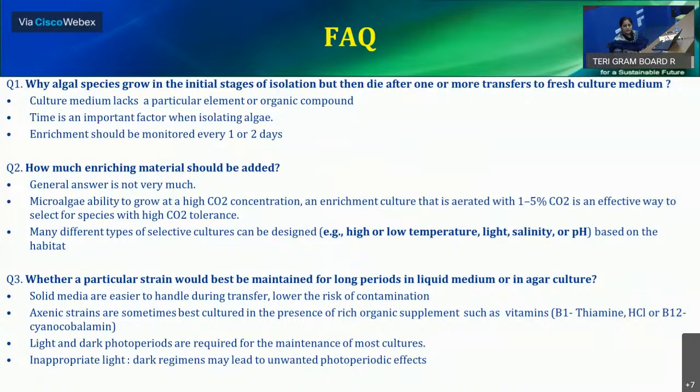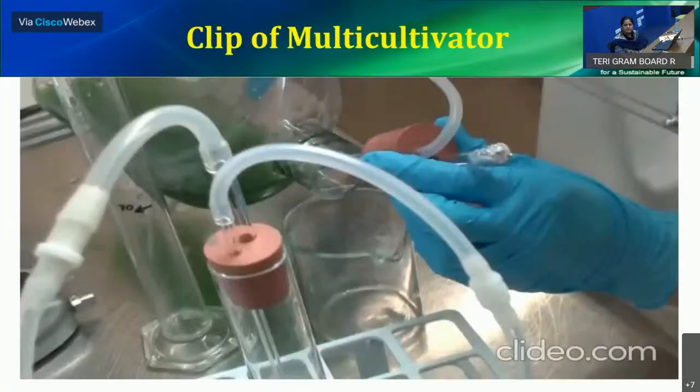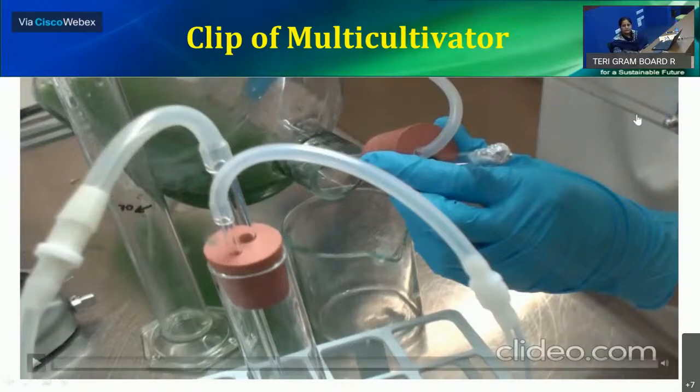But sometimes an inappropriate light to dark phase photoperiod may lead to deformities, and it may inhibit the growth of the algae. So once we have now enriched the media, we further go towards growing these algae and studying their growth pattern. That study I'll be showing in this clip.